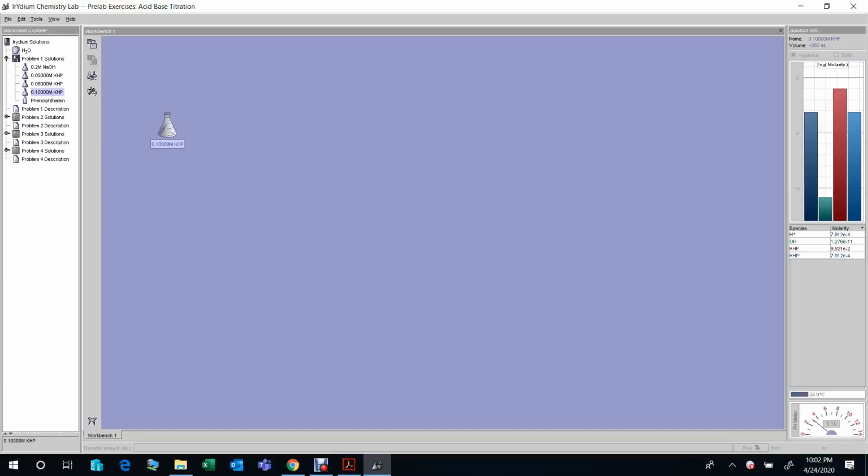Here, it means this one is accurate, and this 0 is accurate, this 0 is accurate, this 0 is accurate, and this 0 is uncertain. There is some uncertainty. If we only put 0.1 molar, that means the number 1 is not certain. There's some uncertainty there. Okay, the rough volume is 250 milliliter, right?